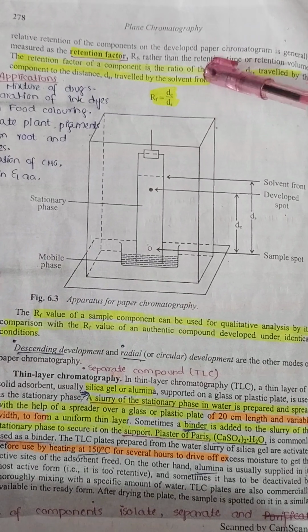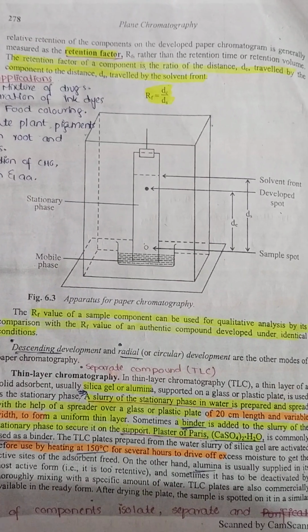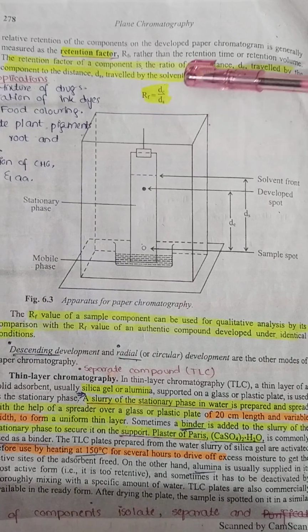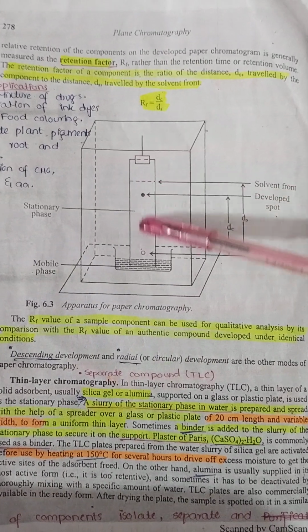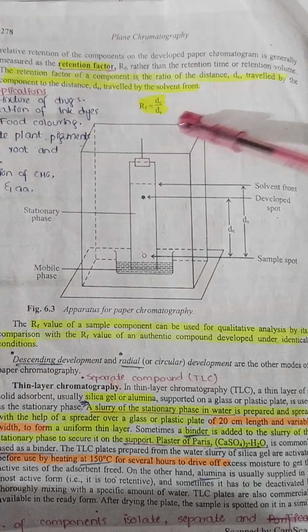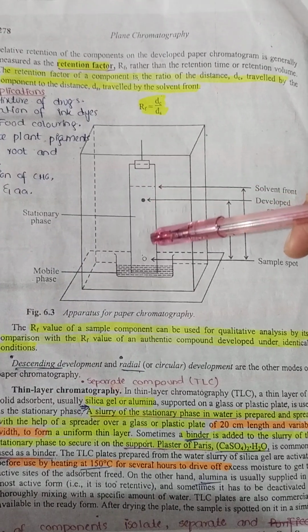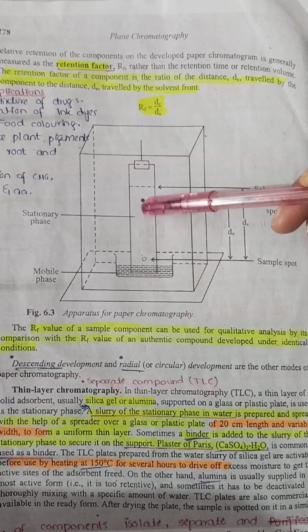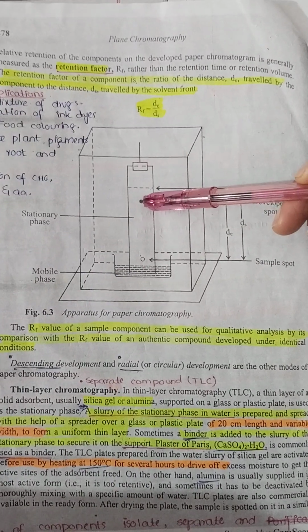We determine the retention factor. The retention factor helps to determine the polarity of our compound, whether it is polar or non-polar. The formula of the retention factor is the distance traveled by the component divided by the distance traveled by the solvent front. For example, from here to there is the solvent front measurement, but from the baseline to our component is the distance traveled by the component.